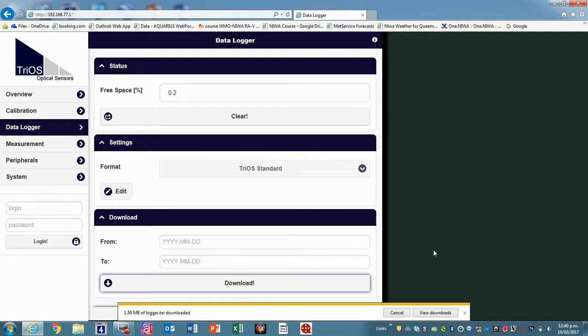It's been over a year since we've done the menu. That'll take a long time actually until you reach 2 gigabytes with that. Will it be 2 though? Well, if you only got 0.2% left, it may well be. Should we be downloading this 6 monthly? I've been asked that the spectrum data is supposed to be quite valuable, so we want to store that. The thing is, the spectral data is a ton and ton and ton of data. If you want to work your way through it, I would really only do this if you have an event.